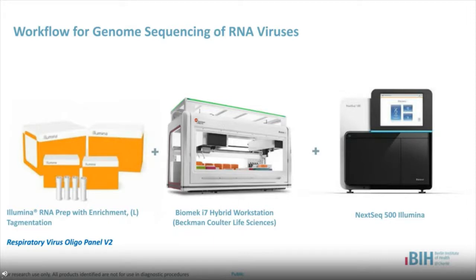We have chosen to implement Illumina's RNA Prep with Enrichment in order to enrich viral fragments or targets from total nucleic acid. More specifically, reverse transcription of extracted RNA and library preparation was followed by enrichment with the Illumina Respiratory Virus Oligo Panel.